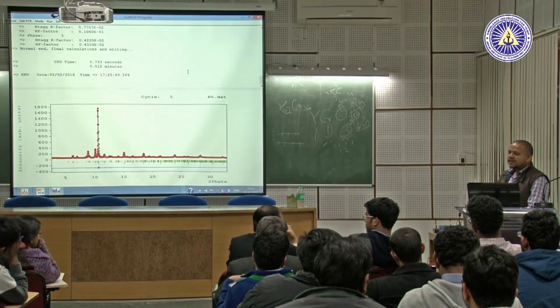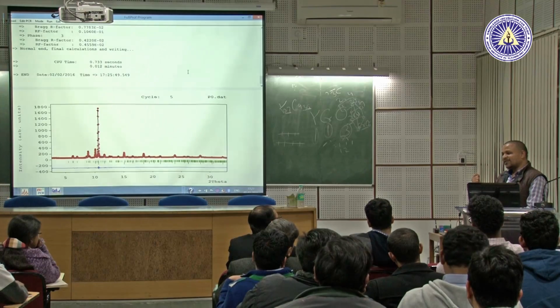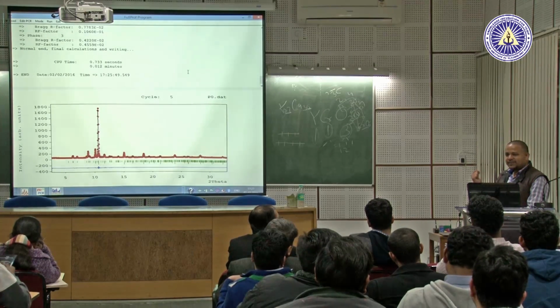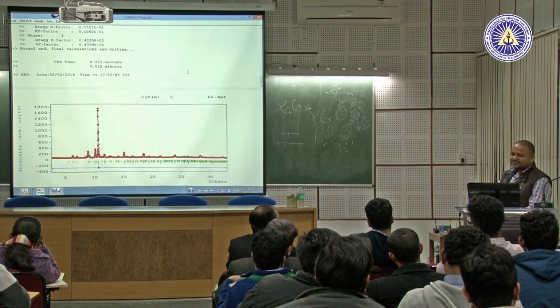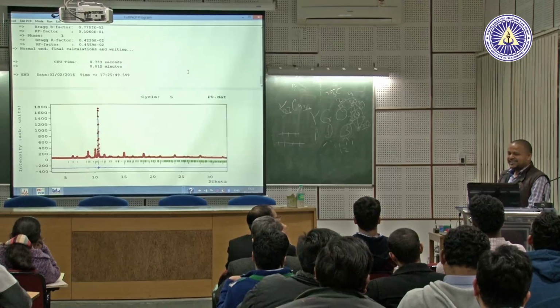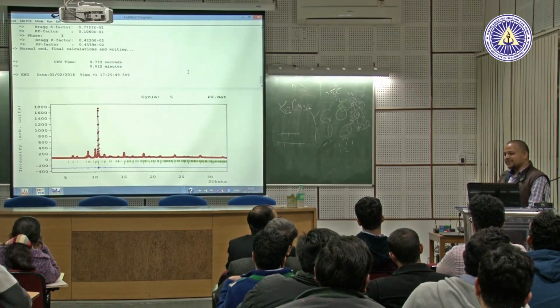They claim it, but if somebody is telling you it comes out in 5 minutes, they will not tell you about these U, V, W, H, I, X parameters, because it will just show the figure in the Origin file. If a good teacher is here, they will also check the students' U, V, W, X. I want to see.